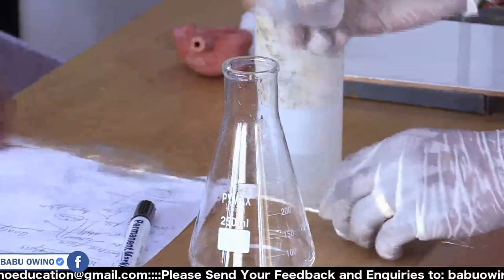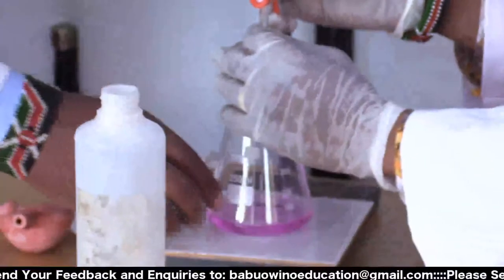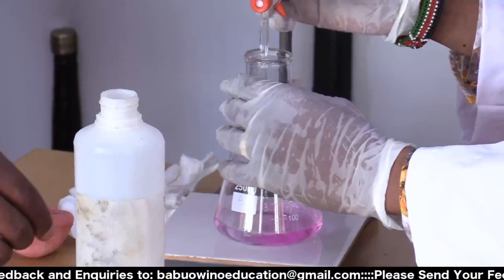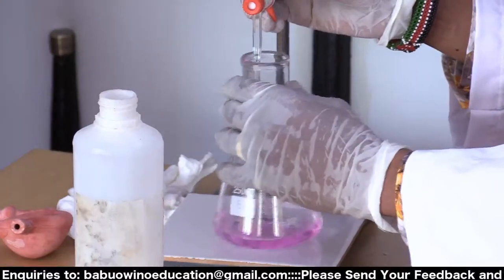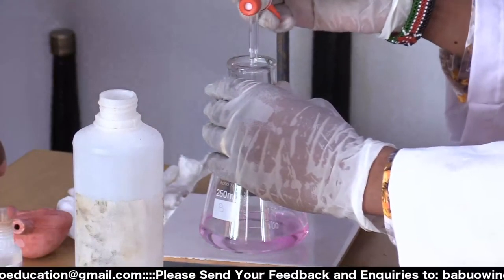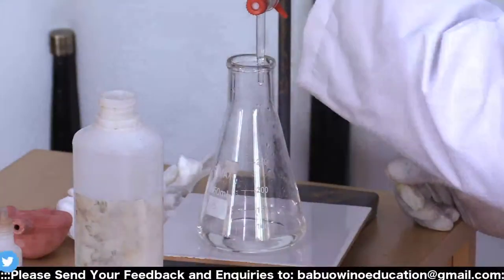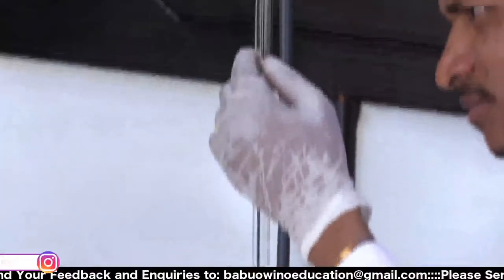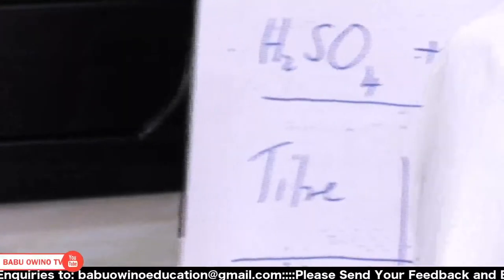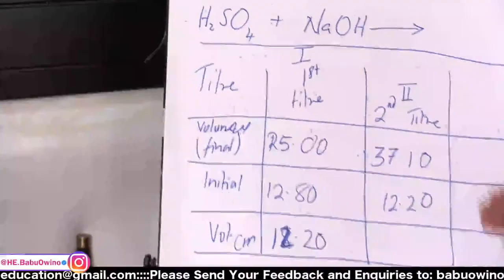Okay, then the indicator, 3 drops. Okay. Then we release it. Check. Drop by drop. Okay. So that's 37.1. You be careful as you read. 37.1. 37.10, if you want. The second decimal point we said can be a 0 or a 5.